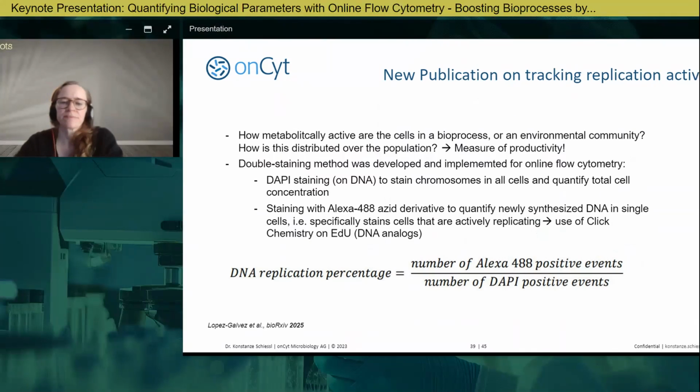And then, oh yeah, I forgot to mention this. This is with the group of Susanne Müller from Helmholtz Zentrum in Leipzig in Germany. So she's a really big researcher on flow cytometry. And we also have a new publication out with her, and it just was posted on bioRxiv last week, I think. And this one is about tracking the replication, the DNA replication of the cells.